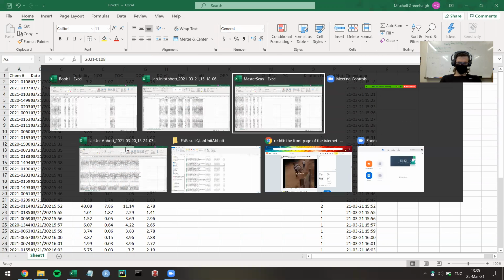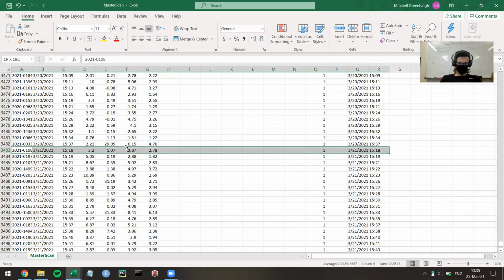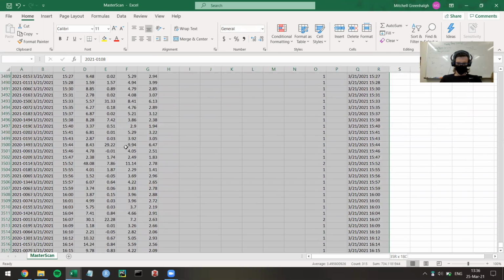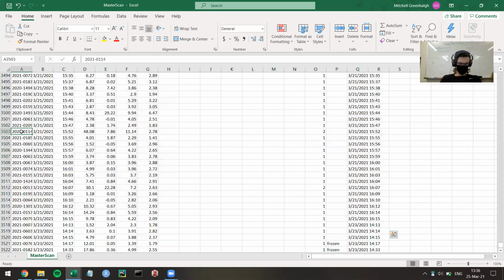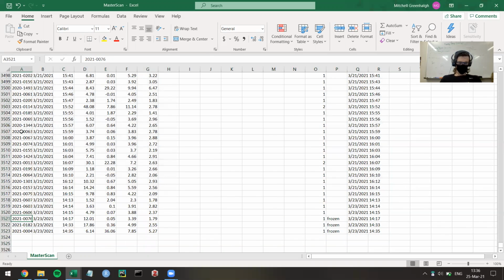This would typically, again, be over here in the MasterScan. But we can see all of this data matches what we just did. You can see the 2 dilution factors right there, our input. And yeah, if there are any notes, there were some notes for the ones run a couple days later.